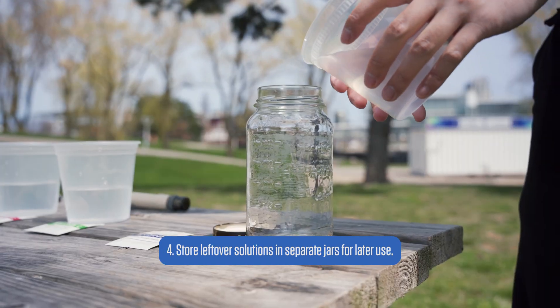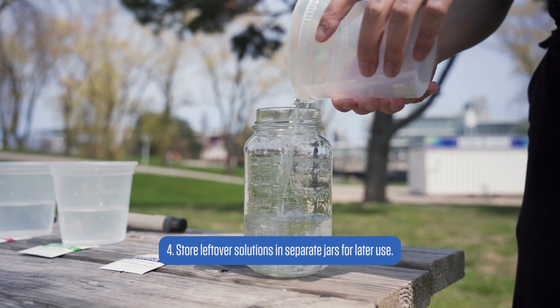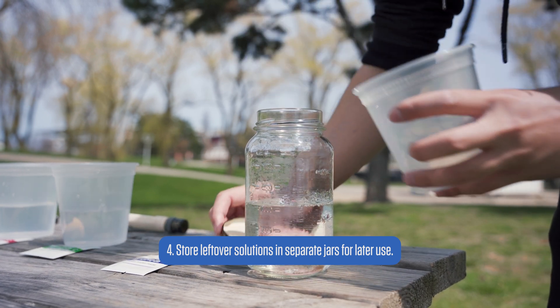The calibration is done. You can store the solutions up to three weeks in jars for future use. This will reduce the cost of calibration and waste, and make sure to dispose of the solution properly if needed.